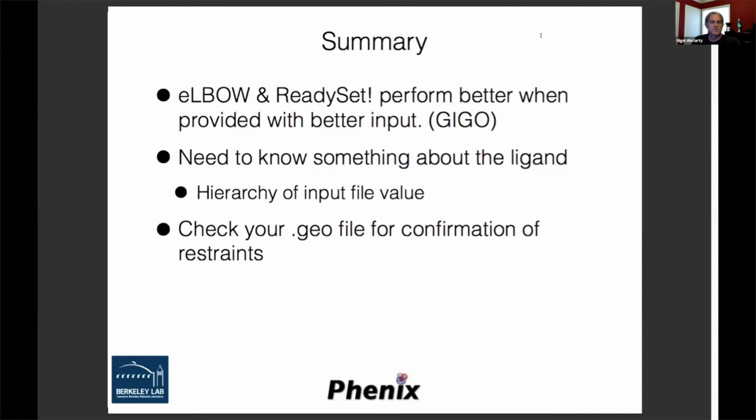So a question from Robert: is there a good way to refine nucleotides manually in a structure? It's hard to rotate around angles in Coot. That might be more a question for Pavel or Oleg. I haven't tried to rotate a base of a nucleic acid. Well, yep, I think that's probably a reference to the backbone. We don't have any manual model manipulation tools in Phenix, so we do rely on Coot. And as Nigel said, there is a new version and maybe there are improvements, but I know that historically nucleic acids have been harder to deal with.